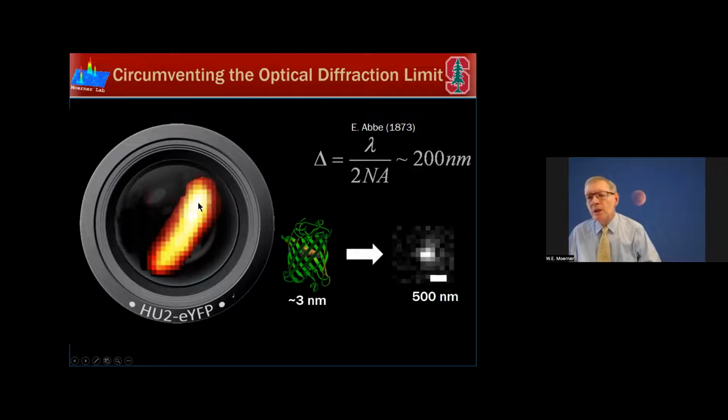So super resolution allows you to change this image that I'm showing you over here to that image. So a huge improvement: if you have higher resolution, a huge improvement in the detail that you're able to observe. And that's what super resolution means. This is roughly 5 times beyond the diffraction limit, which is a tremendous advance. It's not 10%, 15%, 50%, but easily achieved factors of 5 or even 10 in certain microscopes. So when you have much, much more resolution, you will see much, much more. You will see more things.